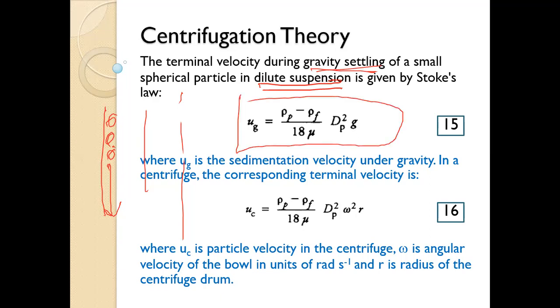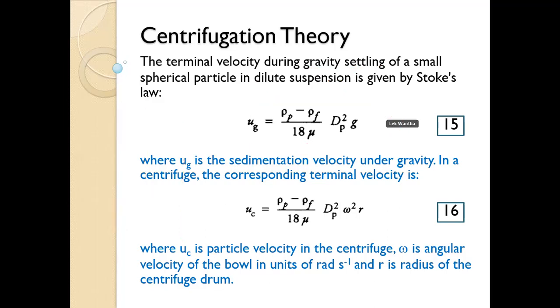Sedimentation velocity is the velocity at which the solid settles down to the bottom. For this case, we can apply the centrifugation force, because we operate based on omega. Omega means the angular velocity, or rotation speed of the bowl.